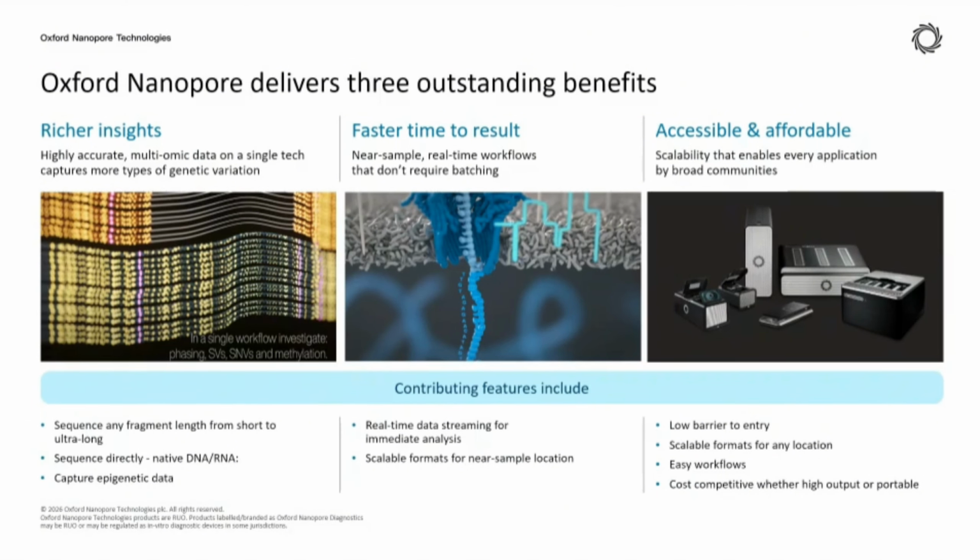In addition to that, so far I think it also has a very fast turnaround time, and it's very portable. We can carry it and do the sequencing in many different environments. It also has real-time workflows, which is quite different from other sequencing technologies. Because the sequencing, or the base calling, happens in real time, we are able to get the data before even the sequencing process is finished.